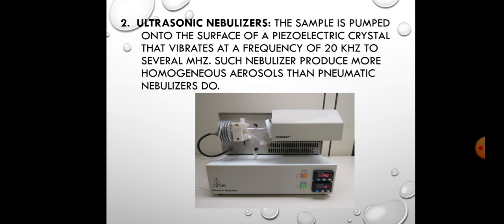We have another nebulizer that is much more effective than the others. This is called the ultrasonic nebulizer. In this one, the sample is pumped onto the surface of a piezoelectric crystal that vibrates at a frequency of 20 kilohertz to several megahertz.